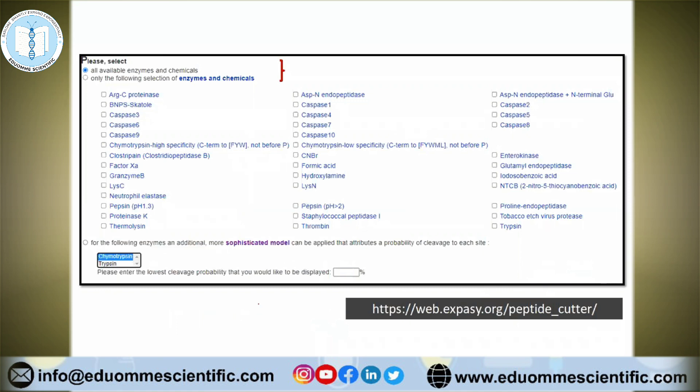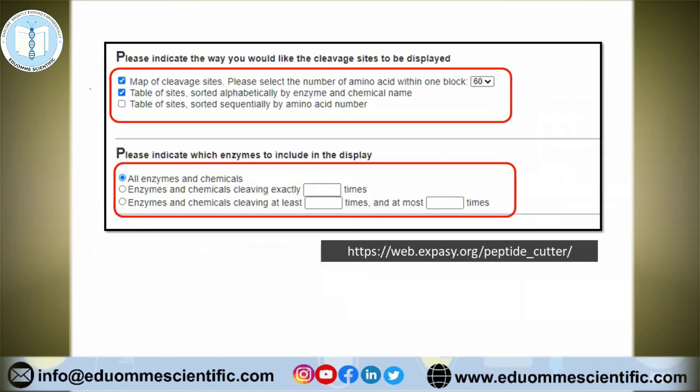If we talk about the display settings, enzyme and chemical selection can be done here. Regarding the output display of the result, we have a few options. Most of the time, results will be displayed in table form — one grouped alphabetically according to enzyme names, and the other sequentially according to the amino acid number where cleavage occurs. The output is also displayed as a map of cleavage sites. We should also be aware that this tool is not used for post-translationally modified proteins; its effect won't be displayed here.